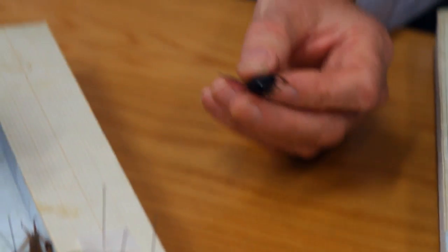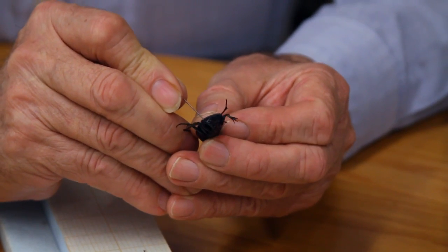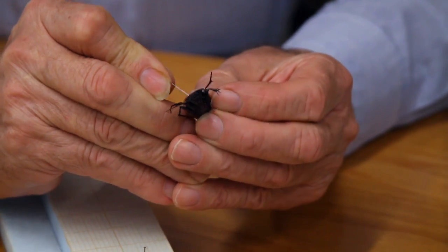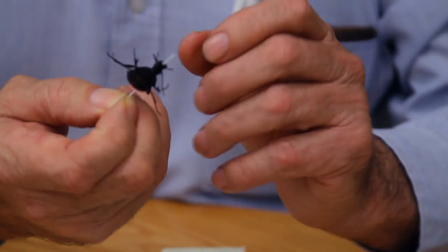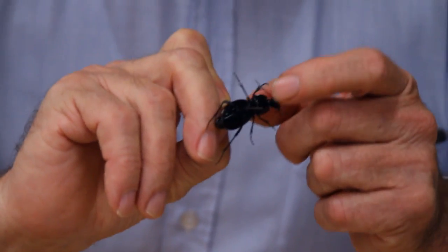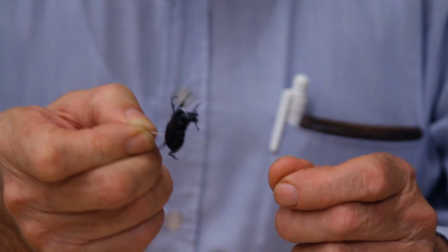The last insect we're going to pin is a beetle, and the location of the pin is different again. We put the pin through the right-hand wing, three-quarters of the way up towards the thorax and in the centre of the wing. The reason we do that is that underneath the thorax there are characteristics we need to be able to see for identification.